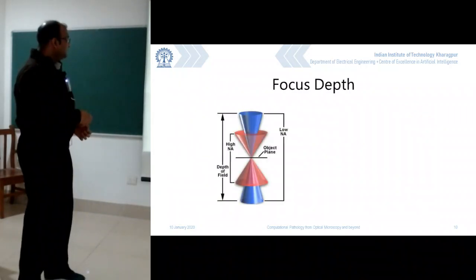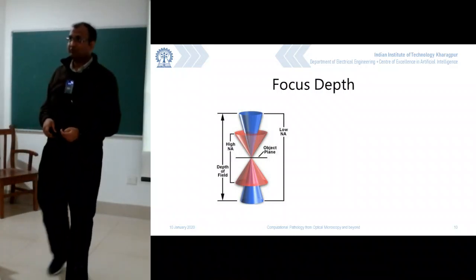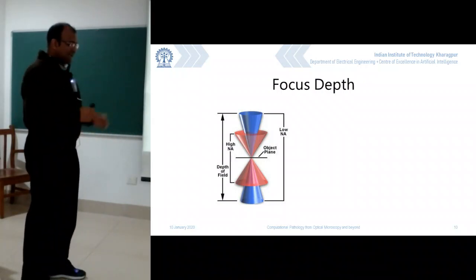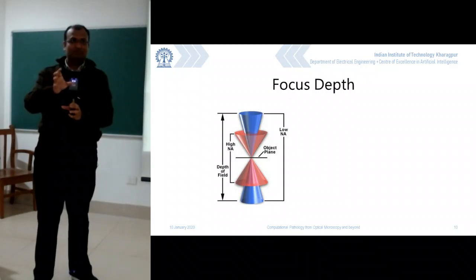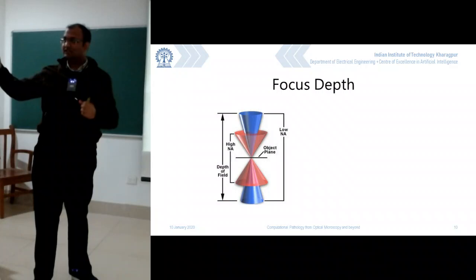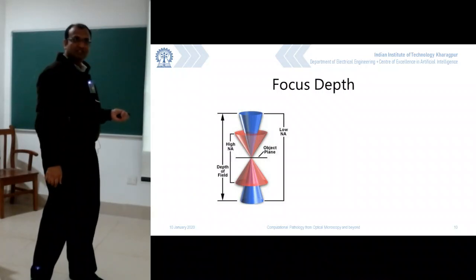There is another issue which comes out along with this numerical aperture, which is called depth of focus. Look at the same thing about a lens. Your white light is going to spread across over there. Typically it's going to be in focus somewhere over here. This is the point where everything is convergent. These are the places where it's not convergent, it starts becoming divergent.